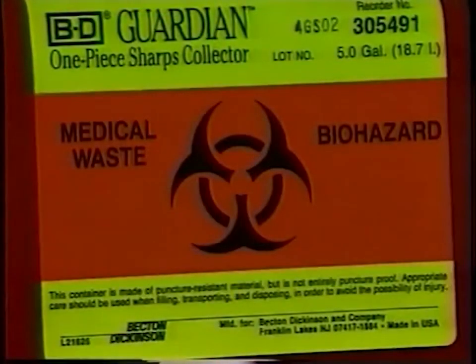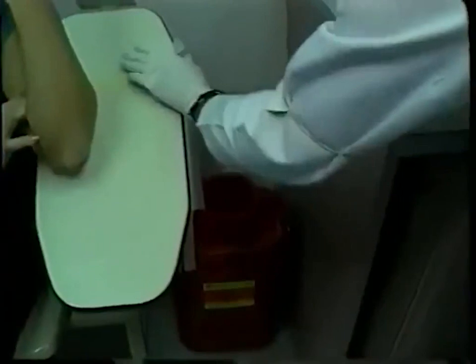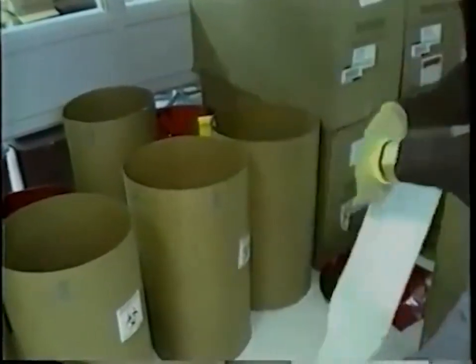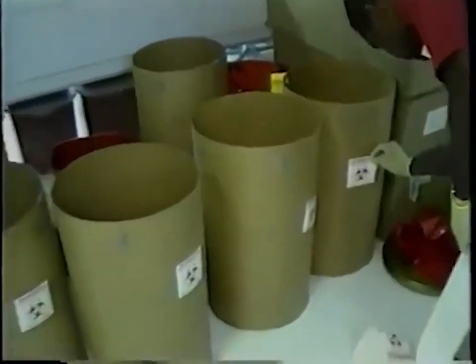It is extremely important not to overfill a sharps container. A sharps container, generally the plastic sharps container, has a designated fill line. The reason for that is to minimize employee exposure and the chances of being stuck from needles or other types of sharps coming out of the container itself. Pressed fiberboard sharps containers must also meet the above standards.